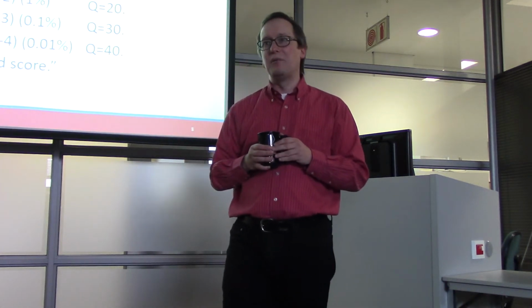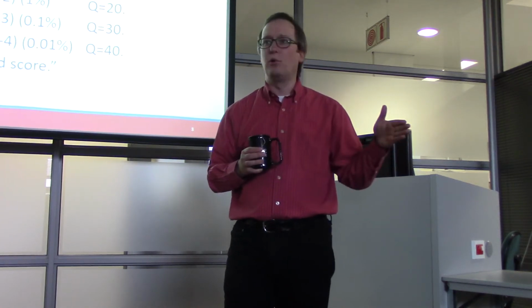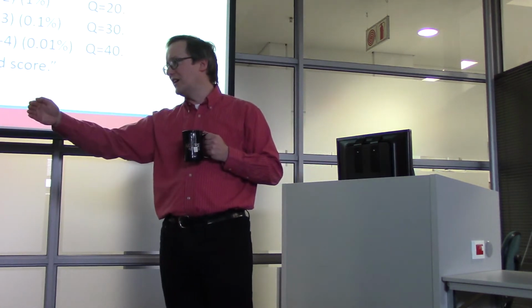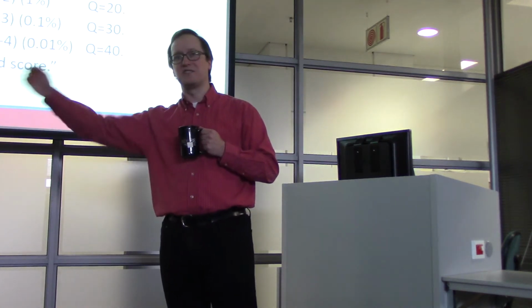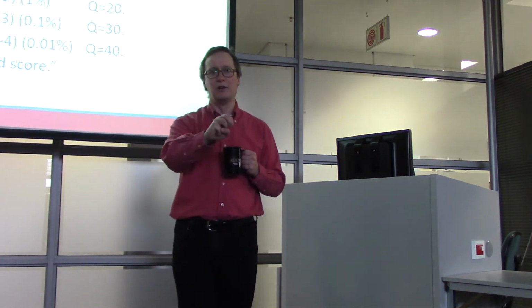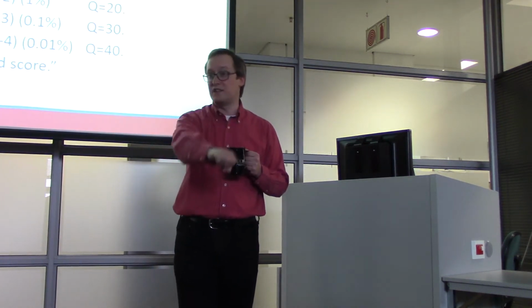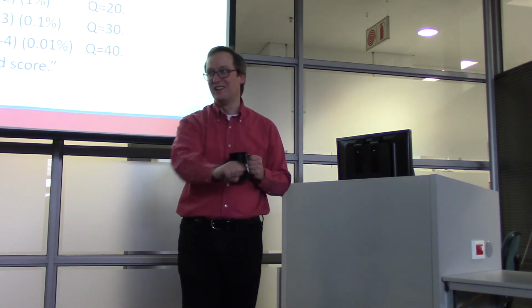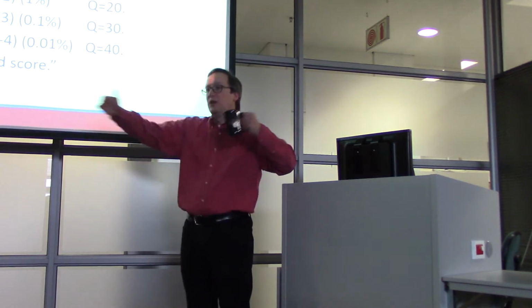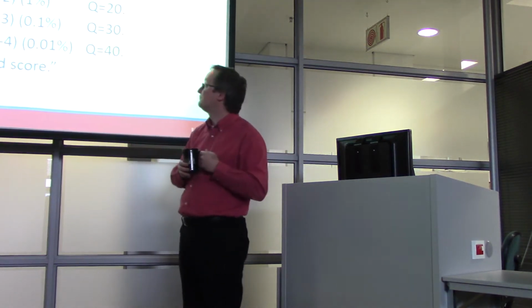When we're looking at probabilities of error, most of them are going to be in this space of much less than 0.1. So being terribly accurate about whether it's an error of 50% or 60% doesn't matter to us very much. But being able to say that this error is 1 in 100 or 1 in 1,000 matters to us tremendously. That's why we use this negative log scoring, because it really explodes that space right close to zero.